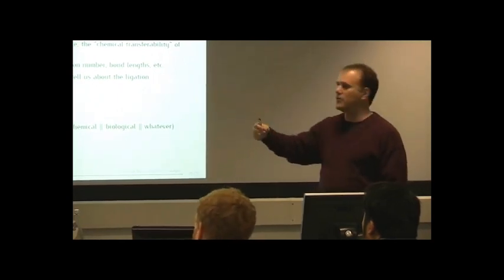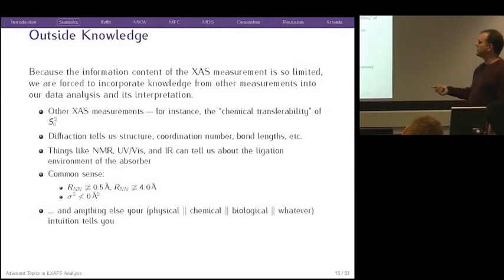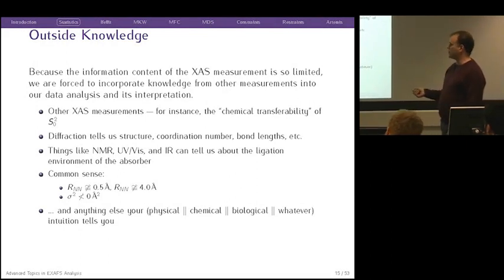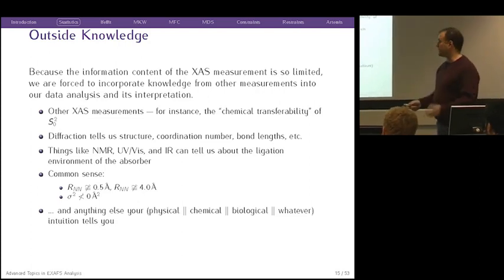So your other measurement might be as simple as another x-ray measurement, but all kinds of other common measurements give you useful and interesting information about the structure of your sample that can guide you in interpreting your x-ray data, and you should use that information.